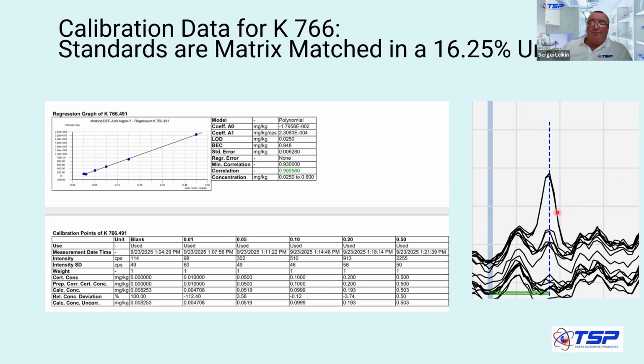It's quite difficult to do, because you see the spectral environment around potassium because of the organics. But just by plumbing in the additional gas, it allows you to run urea at 1 to 1 dilution, or 1 + 1, 1 to 2, which is 50% dilution.